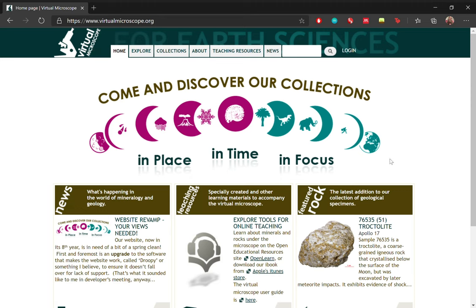Hello everyone, today I will be making a short video to introduce you to a very useful resource that you can use to study rocks in both hand specimens and thin sections online. Because as we all are aware, things are a bit difficult at the moment to access laboratories, to access samples. So this particular webpage is really good because we have a lot of high definition scans of rocks and thin sections.